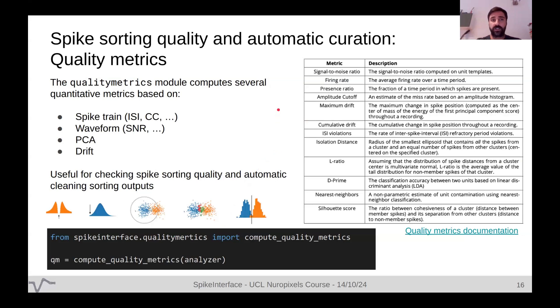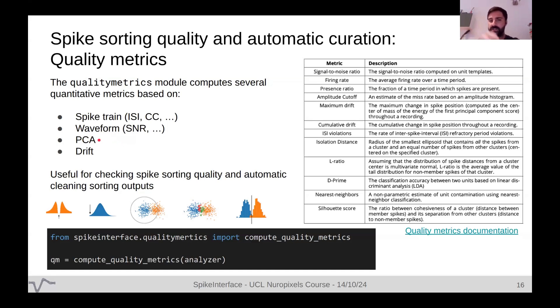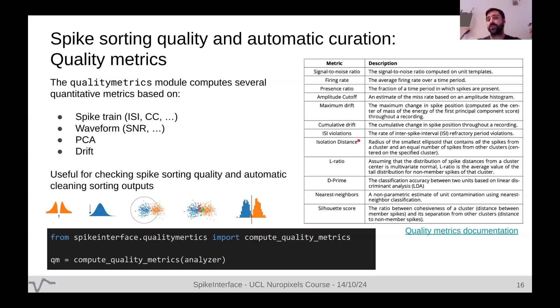In the quality metrics module, we have over 15 quality metrics implemented. They allow you to automatically curate or assess the quality of your spike sorting outputs. Some are based on spike trains, some on amplitudes and waveforms, some on PCA projections of each spike, and some assess whether units were drifted. These metrics allow you to characterize each unit and decide whether to keep it for downstream analysis.